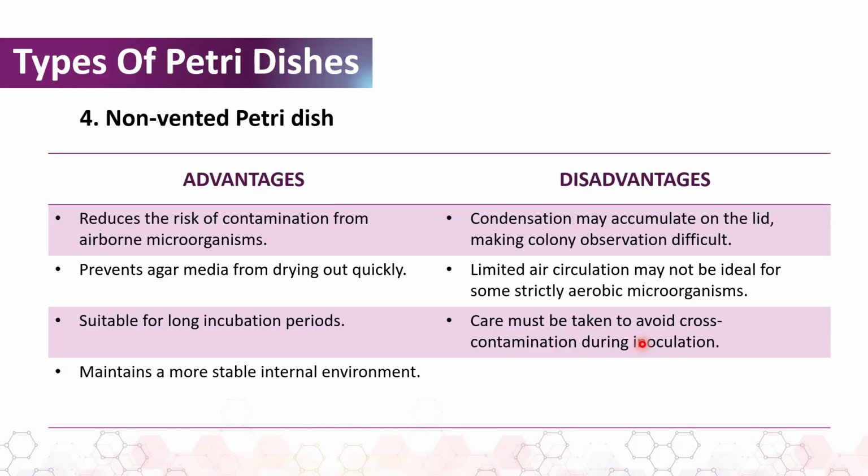Advantages and disadvantages of the non-vented Petri dish. So let's start by looking at the advantages. 1, it reduces the risk of contamination from airborne microorganisms. 2, it prevents agar media from drying out quickly. 3, it is suitable for long incubation periods. And 4, it maintains a more stable internal environment for microbial growth.